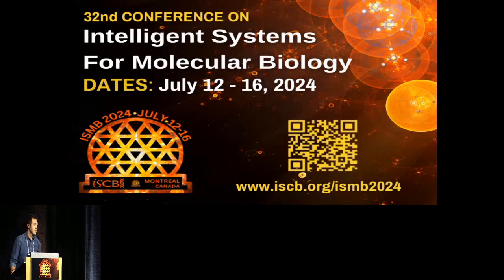Hi, thank you so much for your presentation. I love this integrated visualization of the long and short reads. So you have been using long-read data that already has some time. Now we are seeing, for example, PacBio datasets with 40 million reads in which we have many more junctions detected than with regular Illumina sequencing. So how do you think your framework may change the conclusions when you are not having as much of a coverage problem as you are reporting here? That's a great question.